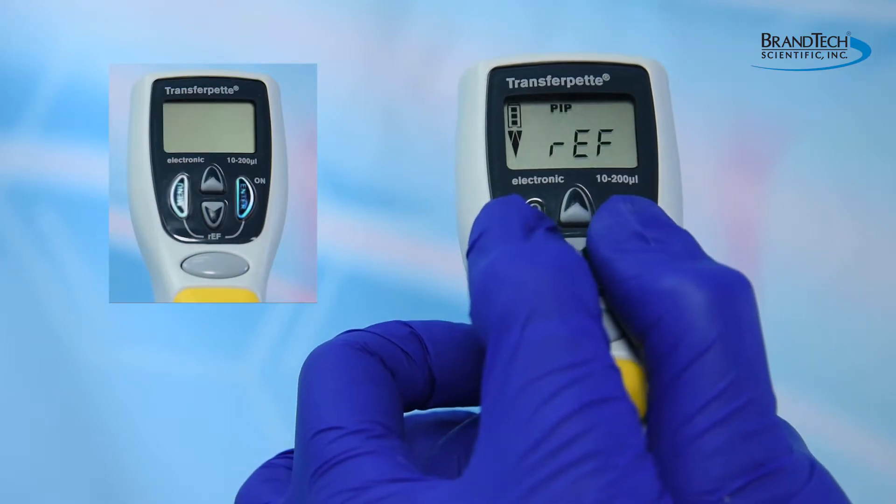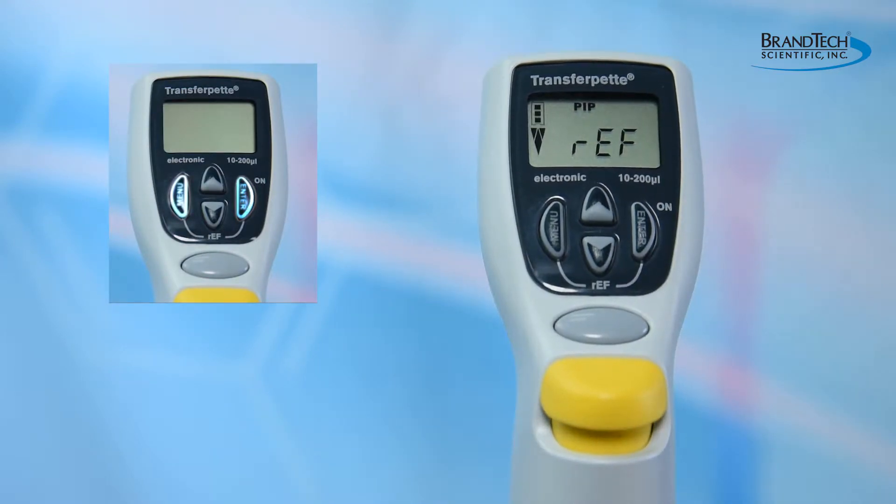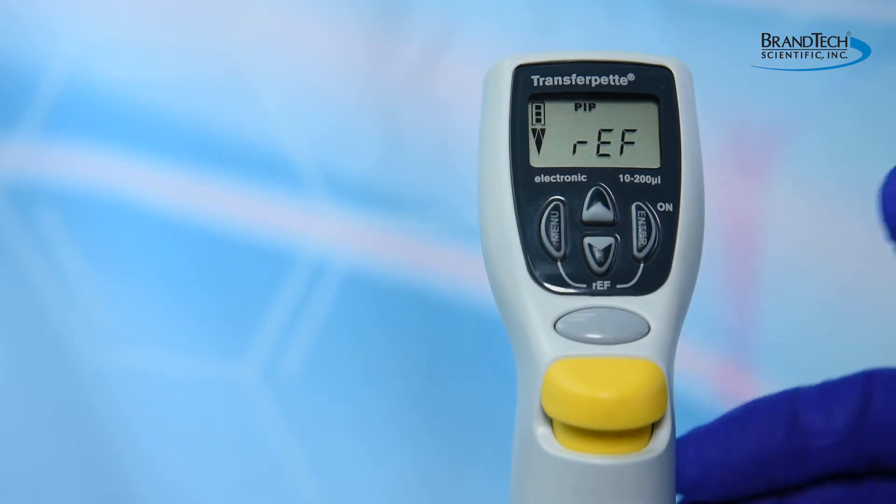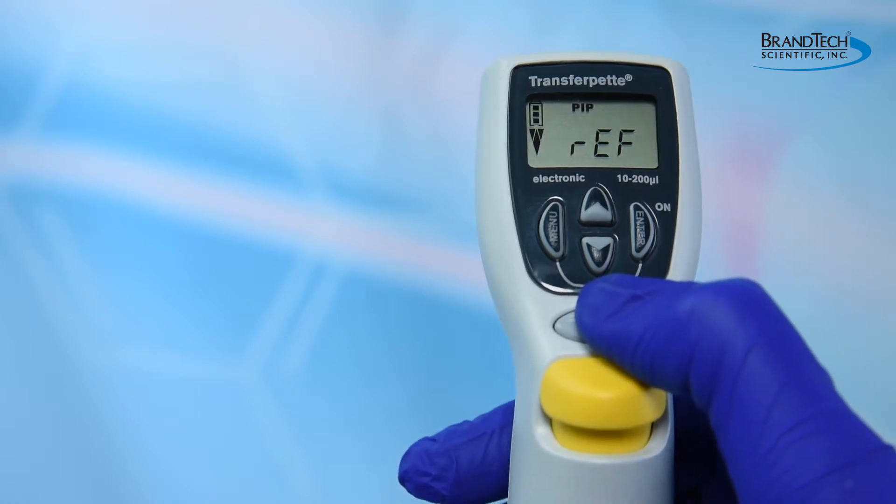To perform your reference movement, simultaneously press the menu and the enter keys. The letters REF should appear on the screen. Press the pipetting key to start the reference movement.